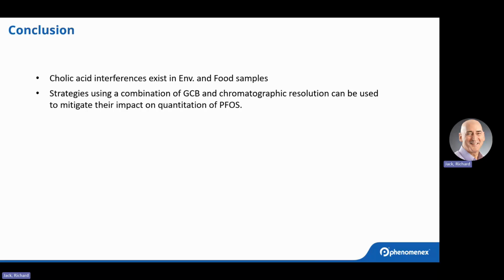Hopefully we'll have more data shortly showing our actual examples in foods. These are ongoing as we speak, but we hope to get some of these in the stack cartridge, specifically applied to validated methods for food as well, in the future.